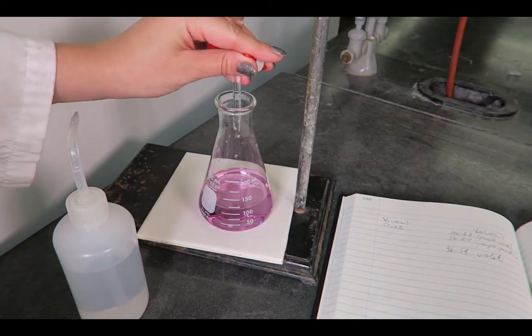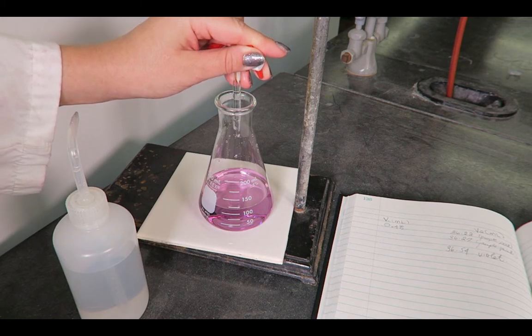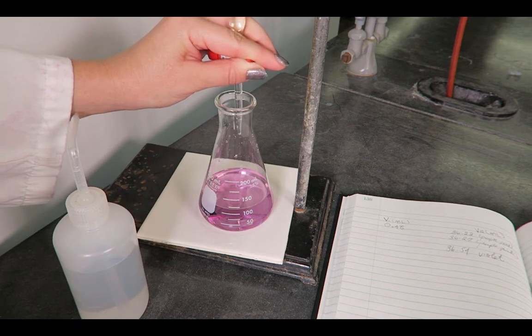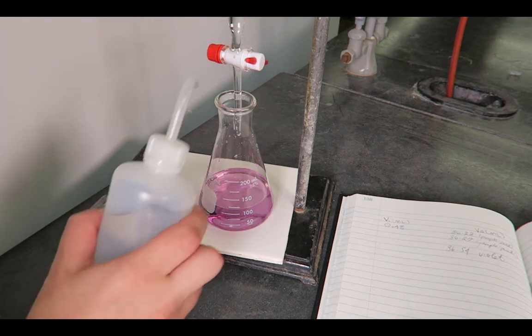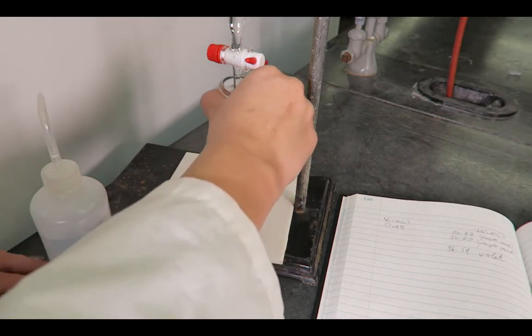During a titration, when the color of the indicator begins to change, it means that the endpoint is approaching. In some cases, the endpoint is vague due to a slow, delayed, or drawn-out color change. Under these circumstances, extra care must be taken to ensure accuracy.